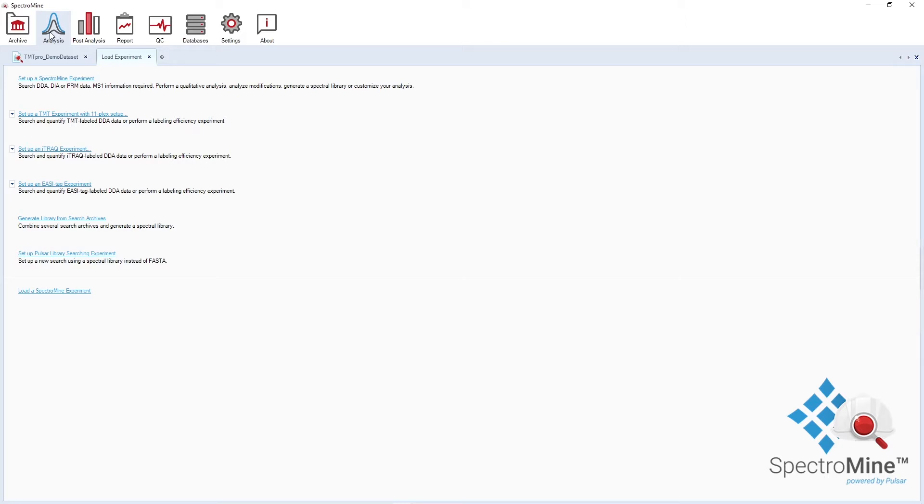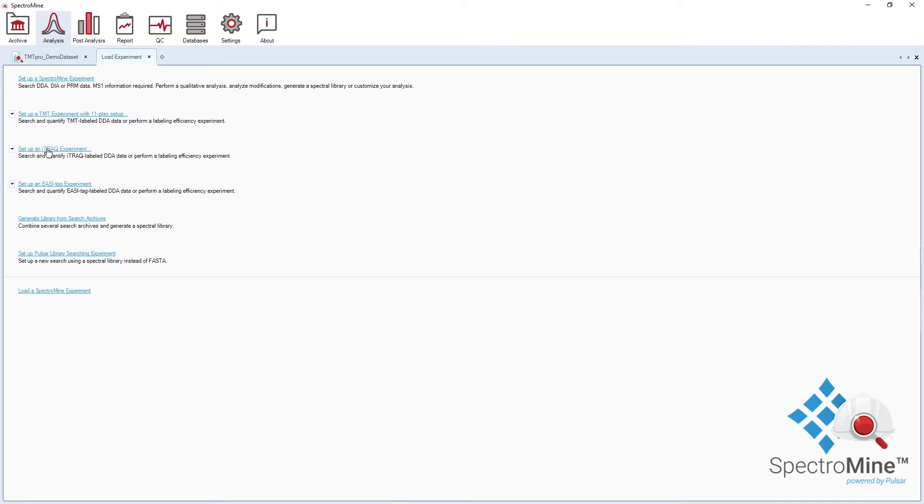Setting up your SpectrumMine experiment is easy and straightforward thanks to the setup wizard. Any type of experiment can be set up with a generic link. In addition, the analysis perspective provides shortcut links to pre-configured settings for the most common experiments. You can set up TMT, iTrack and EasyTech experiments. You can generate spectral libraries from search archives, which will then be stored under the archive perspective, and you can also perform library-based DDA searches.